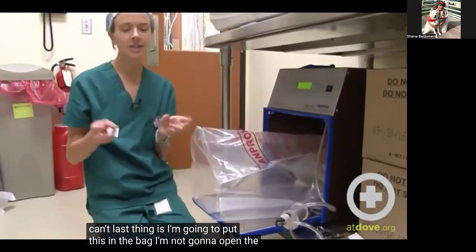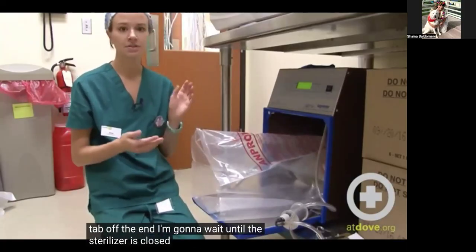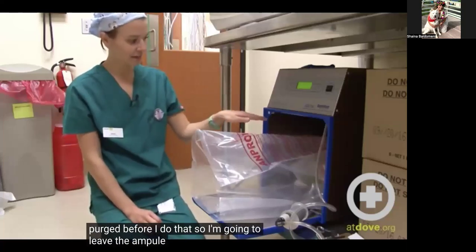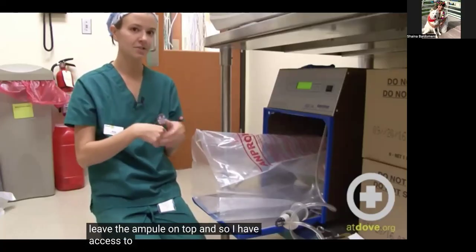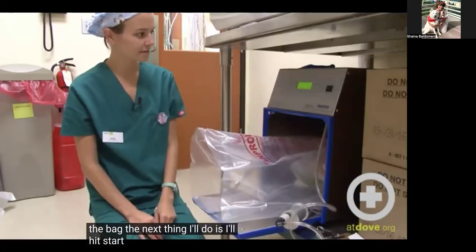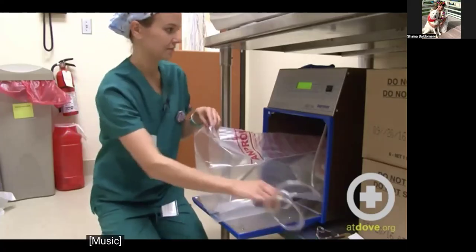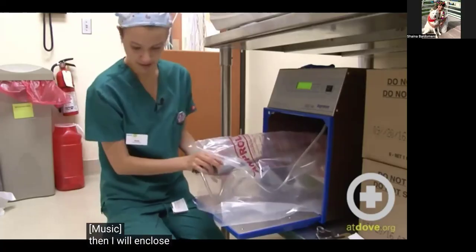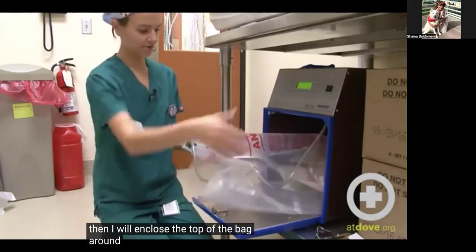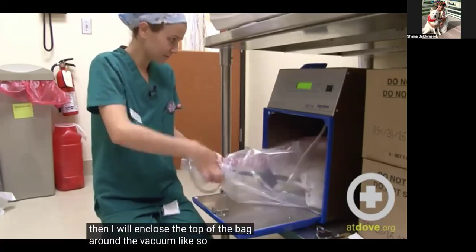I'm not going to open the ampule yet, so I do that by breaking the tab off the end. I'm going to wait until the sterilizer is closed and the bag is purged before I do that. So I'm going to leave the ampule on top so I have access to it so I can open it through the bag. The next thing I'll do is I'll hit start. Then I will enclose the top of the bag around the vacuum, like so.